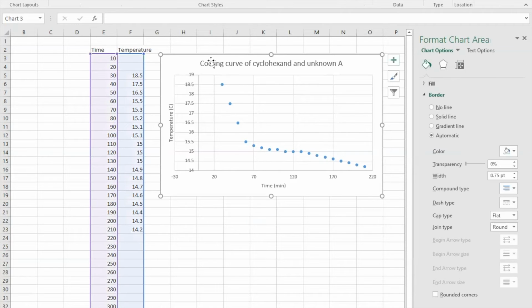Now, what we want to do is find this intersection here. Remember how these first 3 data points make kind of a trend line going down. Then it's not very clear where this data is, but I would say maybe this point that I'm pointing to, 90, 100, 110, 120, maybe this point 130, make a second trend. Then you want to look for where those 2 trend lines overlap. So how do we do that?